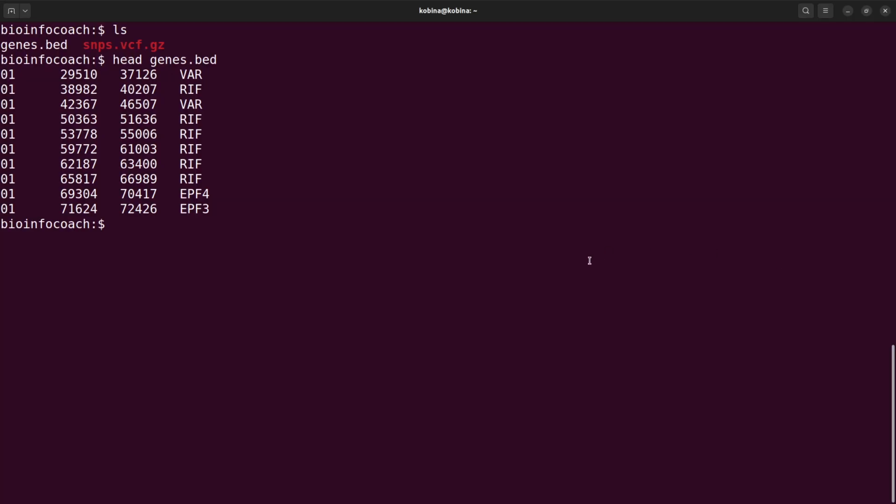All right, so that's what I just did. I just ran head, and we have it here: chromosome, chrom start, chrom end, and then the name. Okay, the gene name, we have that here. Now you realize that for the chromosome names here, I have 01 up to I think 14 or so.